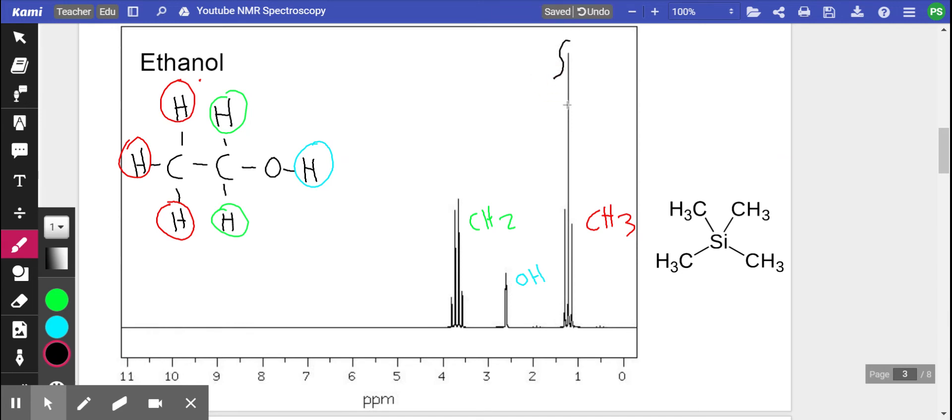And if you do the integration, the machine will tell you there's three hydrogens in this particular environment, whereas here there is only one, and here there's two. And that will give us a lot of useful information about what the structure is, are there any branches, what functional groups are there.